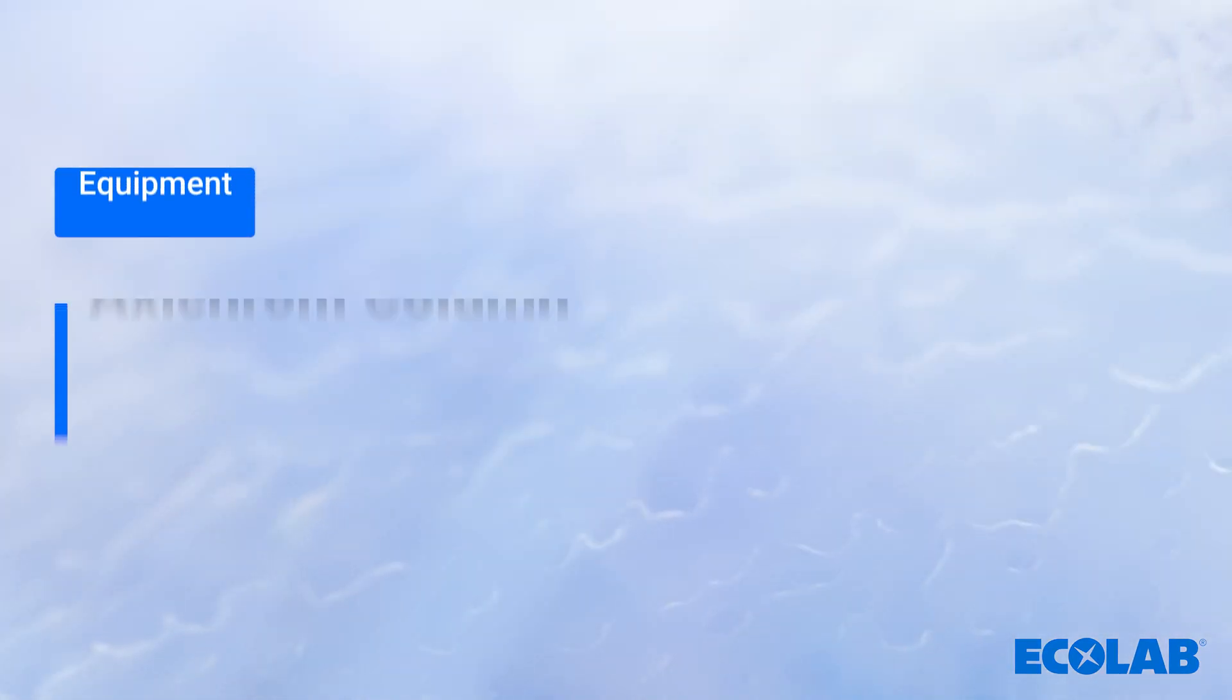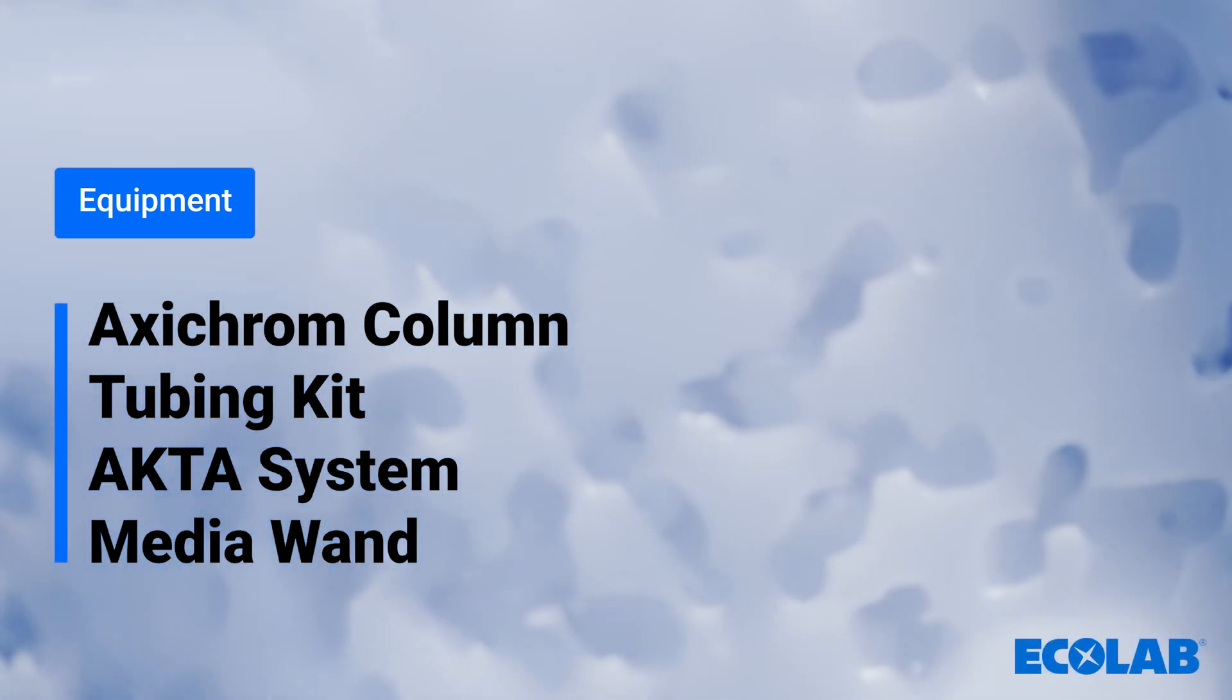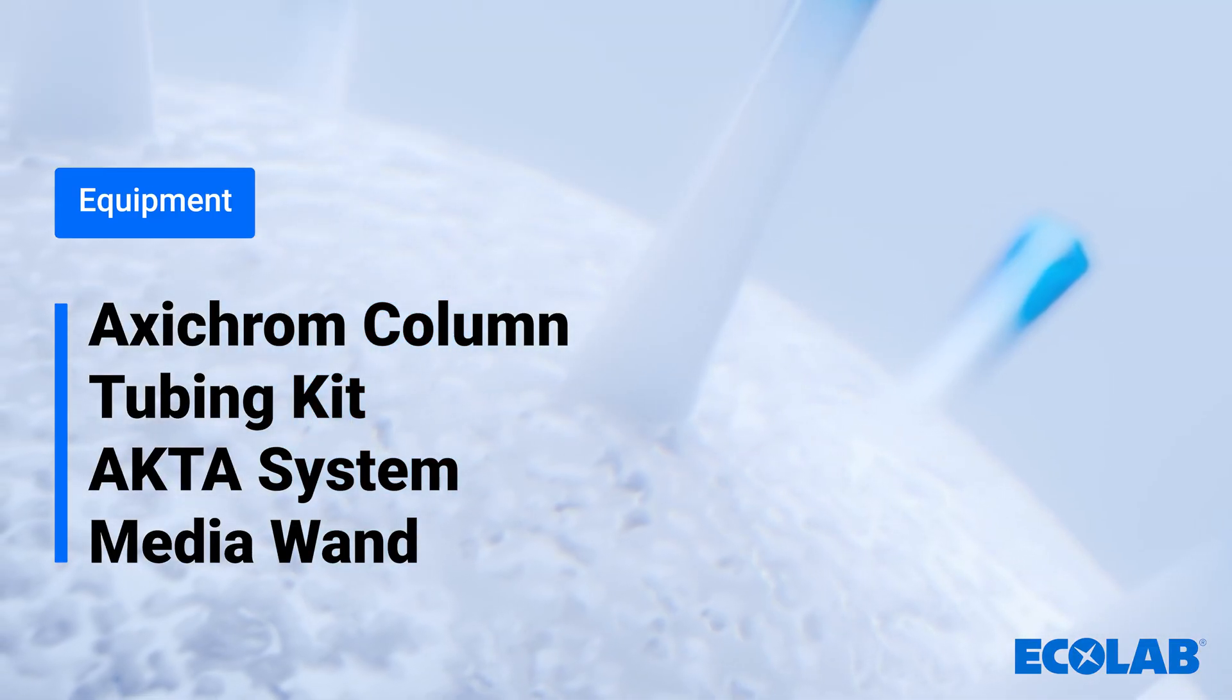The equipment required is an Axichrom column at a 7-20cm ID. In this video, we'll be demonstrating with a 7-centimeter ID column. You'll need tubing kit, an ÄKTA system, and a media wand.